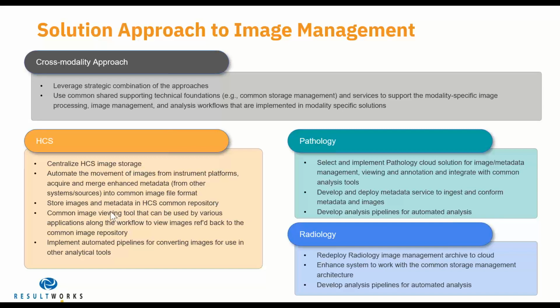We did get to a better place around storing images and image metadata in a common repository. We did get to a common set of viewing tools that could be used by various applications and reference back to the common image repository. And then we also worked through automation pipelines to convert images for use in various analytics tools that were used by the high content screening groups.